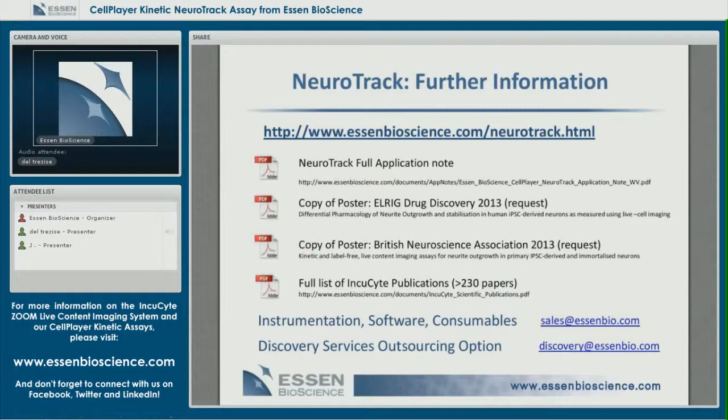regional specific. And I think going forward we would really like to have, as I'm sure the community also would have, regional specific neurons. So for example, dopaminergic neurons or cholinergic neurons or forebrain neurons or whatever it would be.